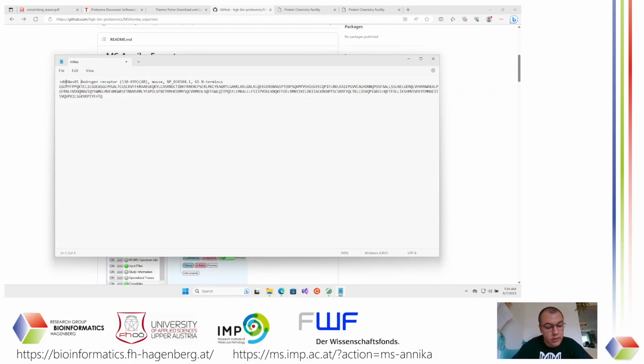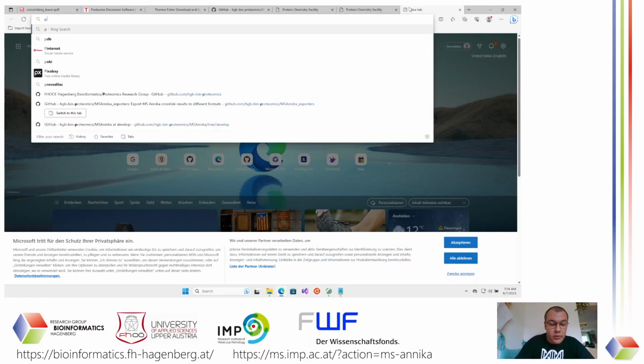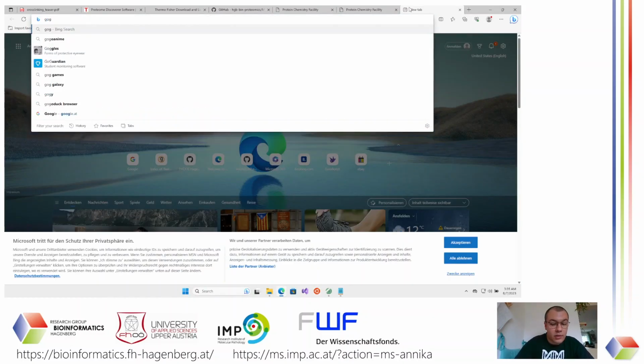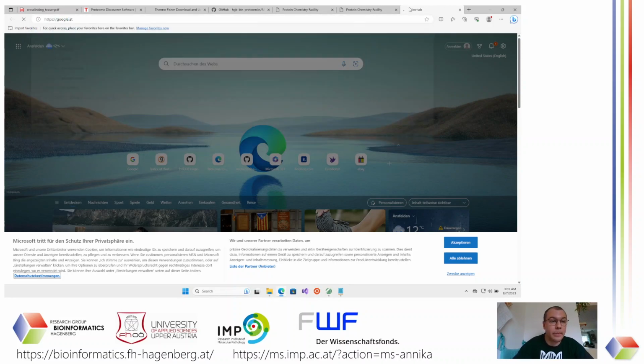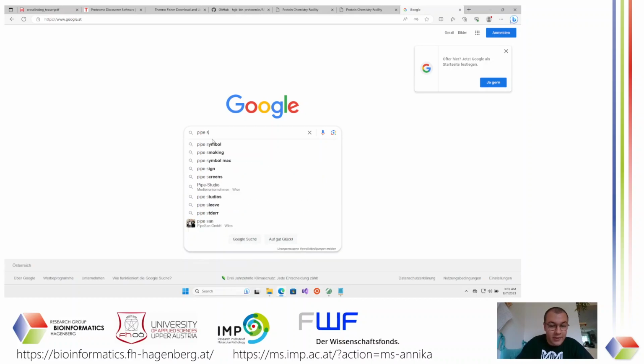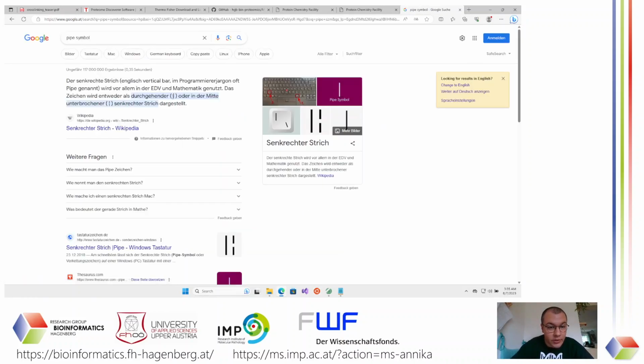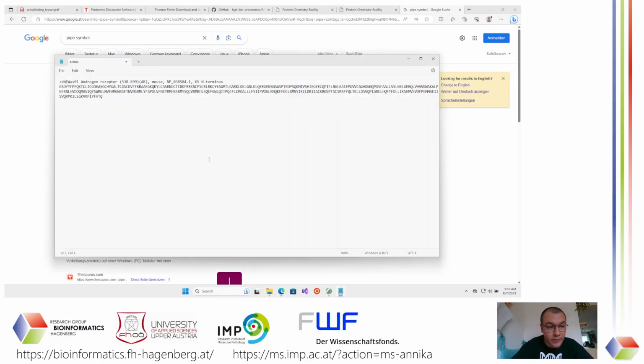It seems like... nope. If that happens to you, you can just go to Google for the pipe symbol, and we are just going to copy and paste this into our fasta file.